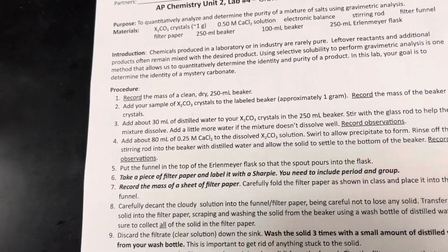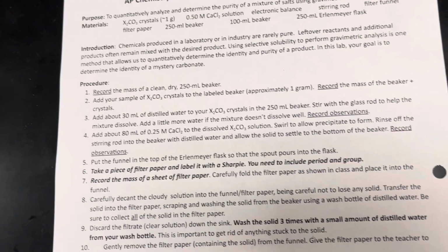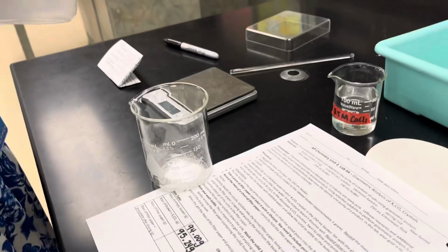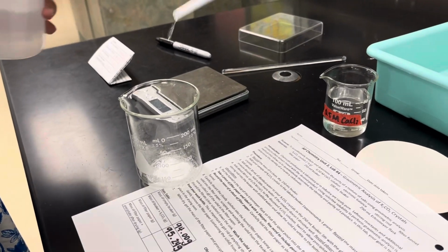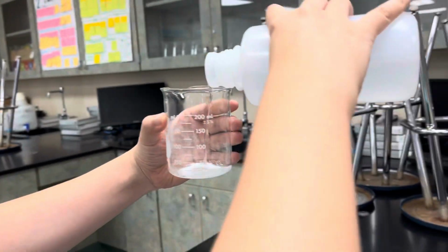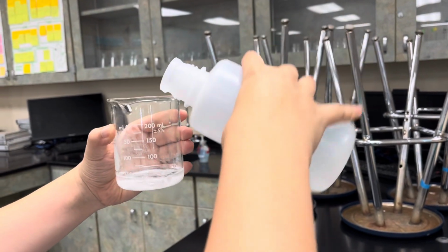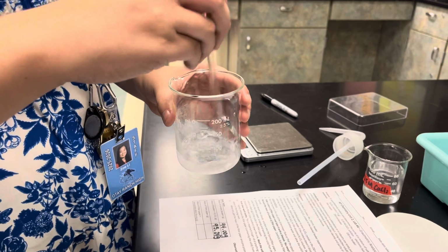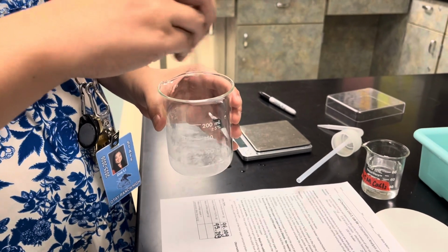Add about 30 milliliters of distilled water to the X2CO3 crystals in the beaker. Stir with the glass rod to help the mixture dissolve. So I'm going to pour a little bit of water in here, just to about the 30 milliliter mark. And I need to stir it with my glass stirring rod to make sure all of these crystals dissolve.